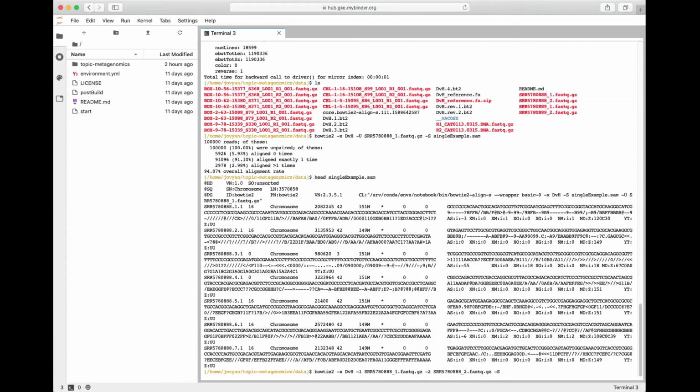And once again, we have the SAMtools output file name. And this time I'm going to call it paired example.sam. And the other new thing that I'm going to introduce here is the ampersand and arrow. And that means that I am directing the output that would have gone on the standard output.